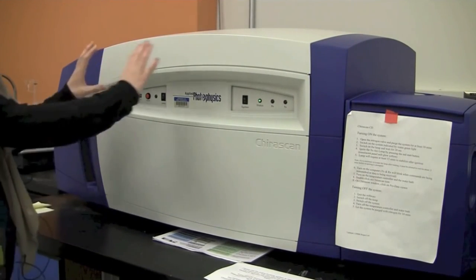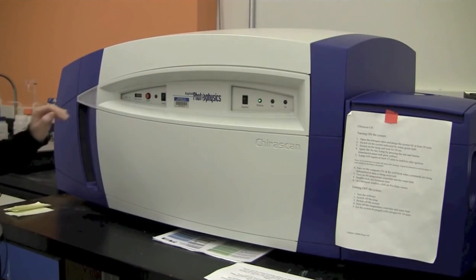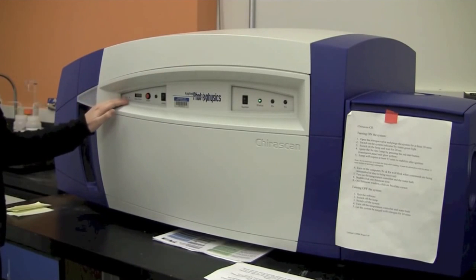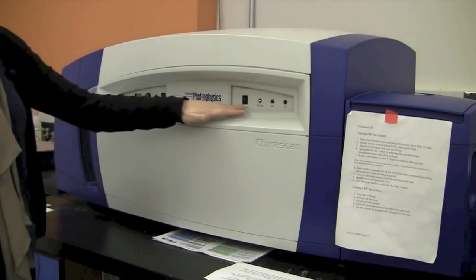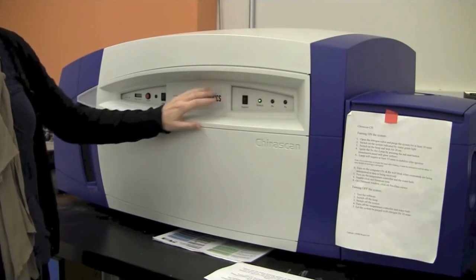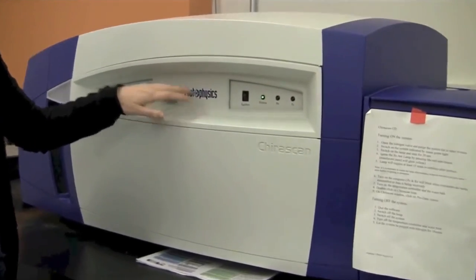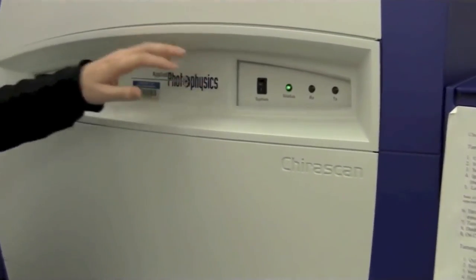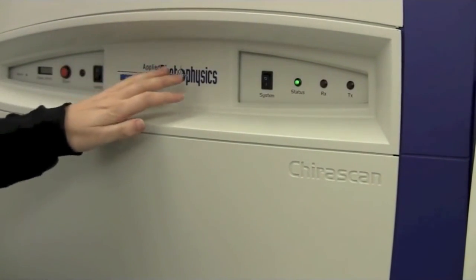In the main body there is first a lamp power supply that powers the lamp and then there's an electronics unit over here. That is the brain of the system where all the communication to the different parts happens.